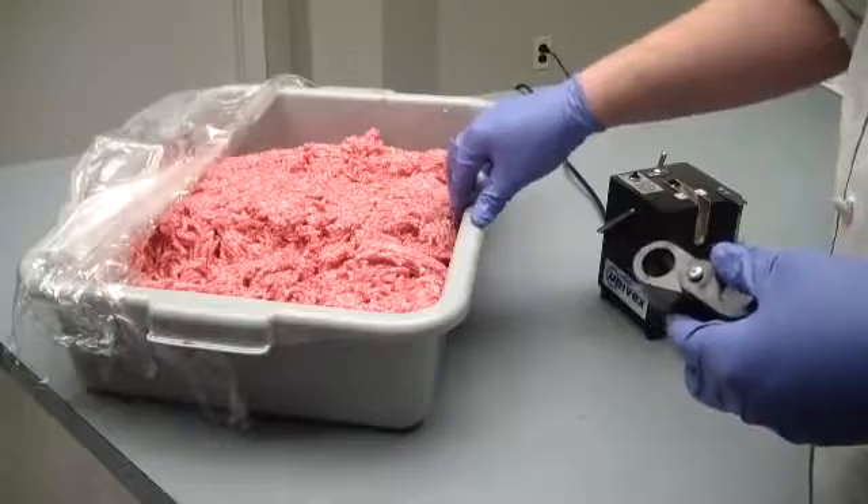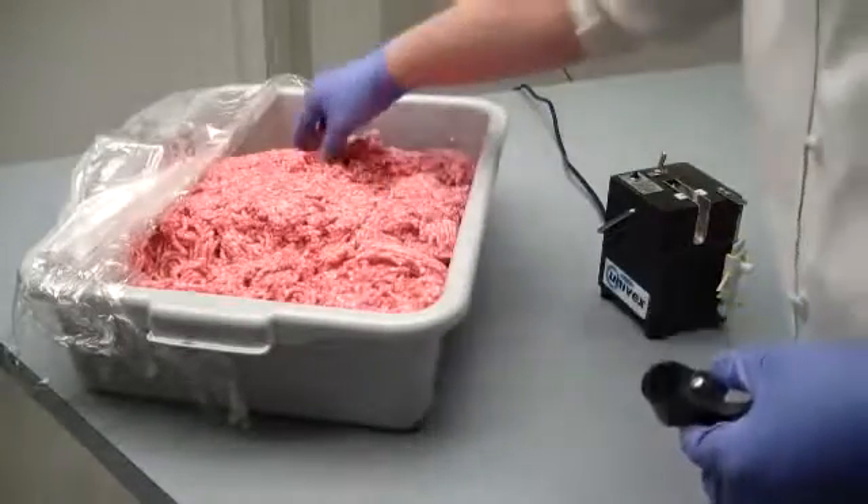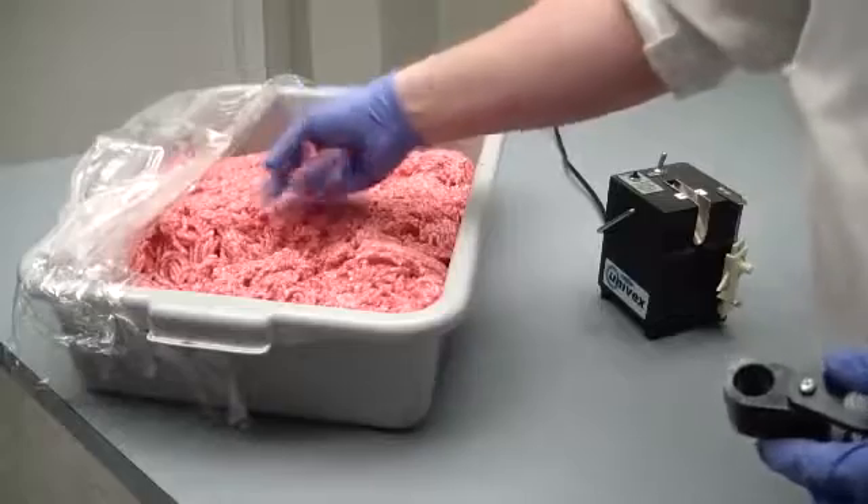When you go to take your meat samples, make sure you take a sample from different areas of the tray. That way you get an even result.